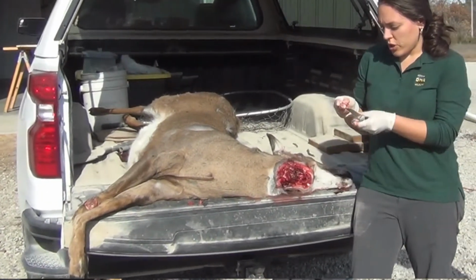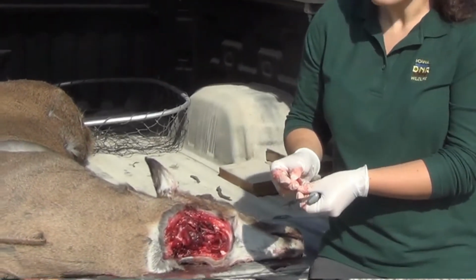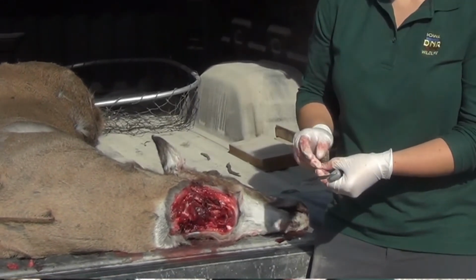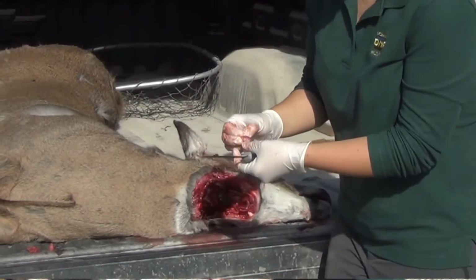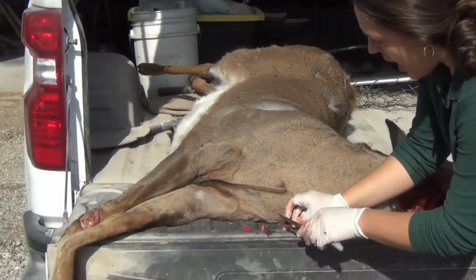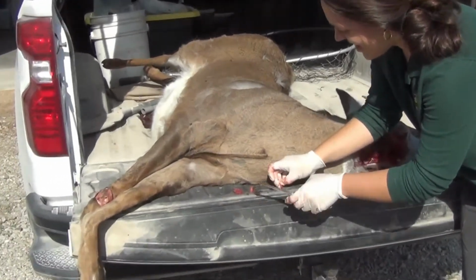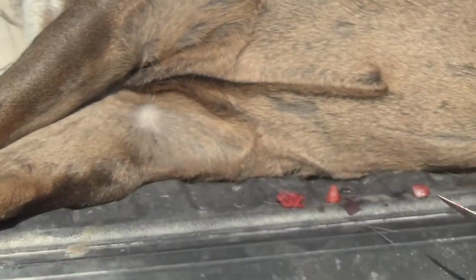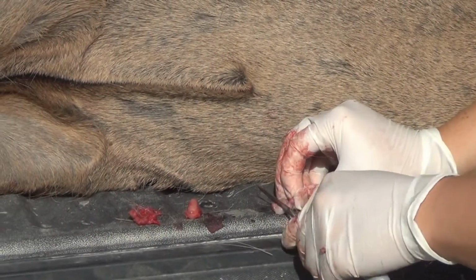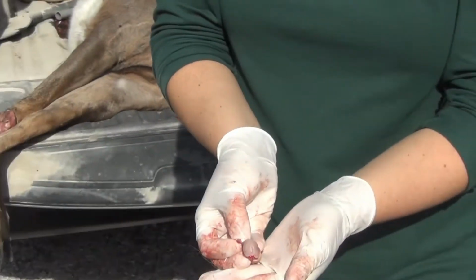The other thing you can do, especially when they're colder and you might not be sure, and things have congealed, is you can actually cut into them. You can cut in half. So we can go ahead and do that with this one. We're just going to cut it right in half. And if you look inside, a lot of times you'll see it'll have a pinkish core right in the center and then become a tan white on the outside.